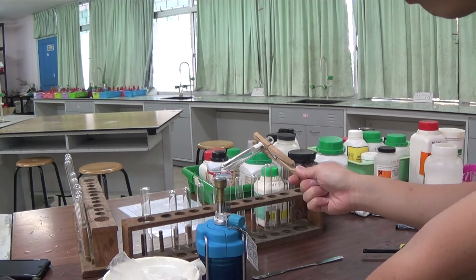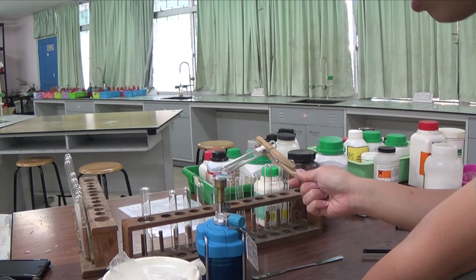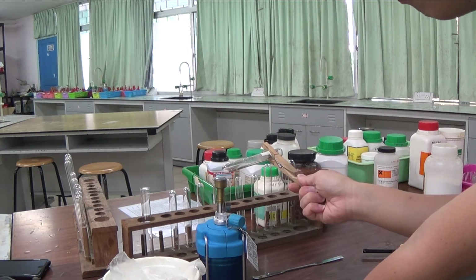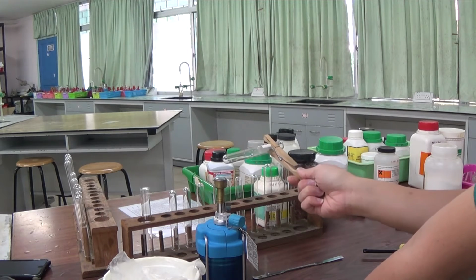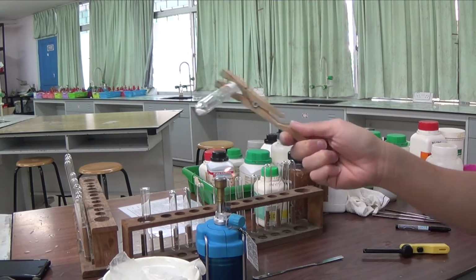Okay, so I'm just heating the solid, just like I did in the other tutorial videos. We will see colorless liquid form on the upper part of the tube. I'll bring it close to the camera so you can see it in a little bit. So I'm heating it strongly. By right, I should be heating in a boiling tube because a boiling tube is meant for heating. But yeah, I'm just heating it in a test tube, so I don't want to be heating it too strongly.